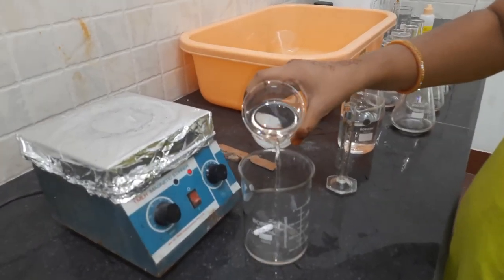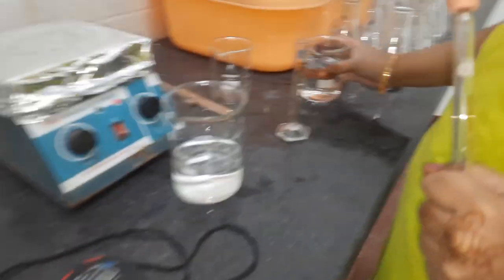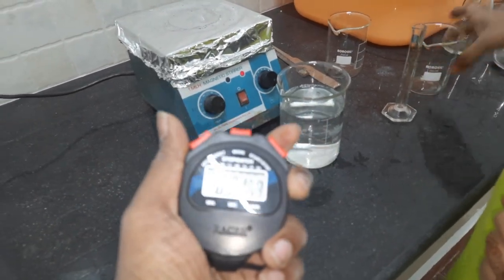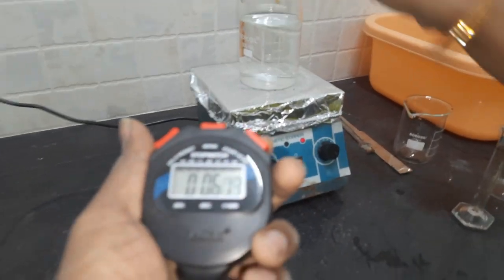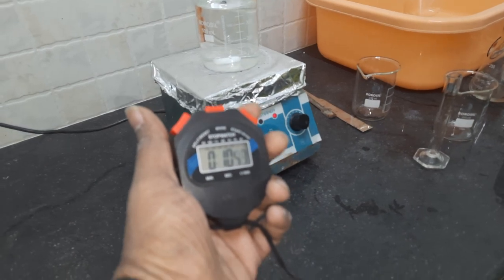What are you doing now? Now I am adding NaOH, 200 ml, and ethyl acetate. Start the stopwatch. Every 1 minute.